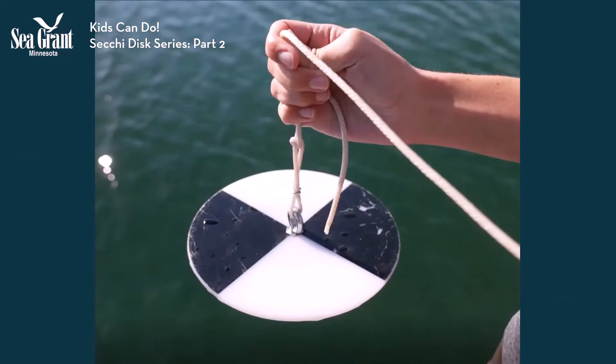As we discussed in part one of this video series, a SecuDisc is a simple device that you can easily make from low-cost items purchased at your local hardware store or from parts scavenged around the house or classroom. Building and using a SecuDisc to monitor the water clarity in a lake near you can make a great science project.